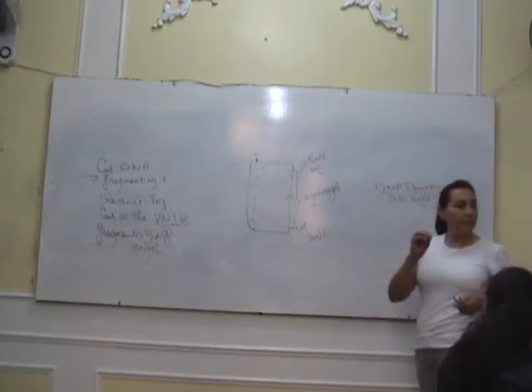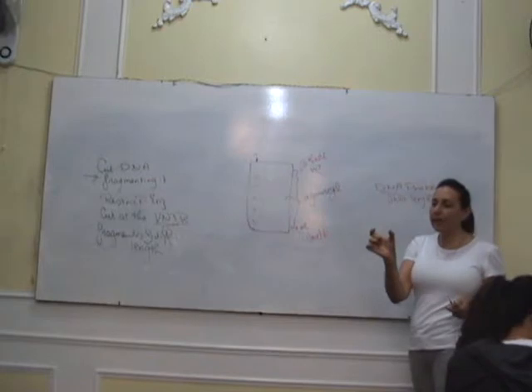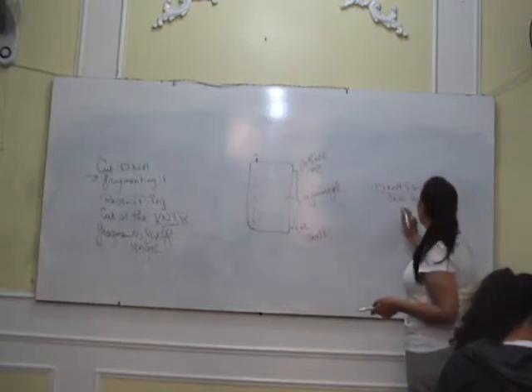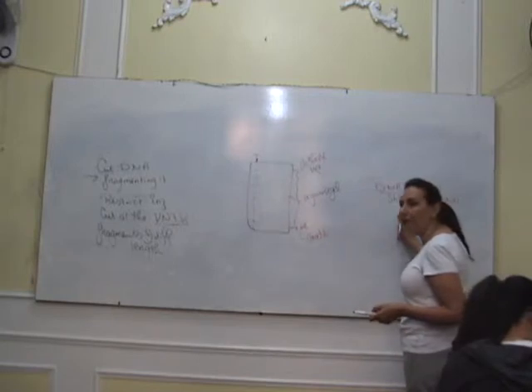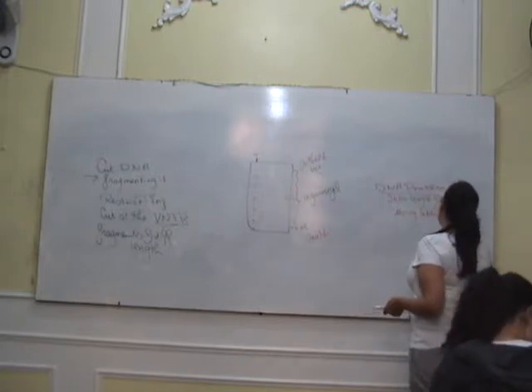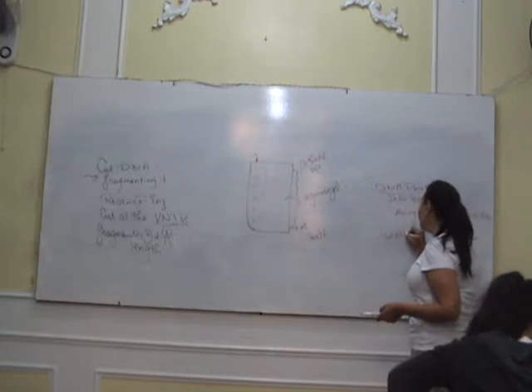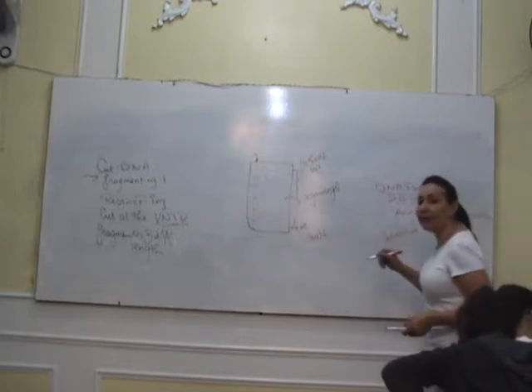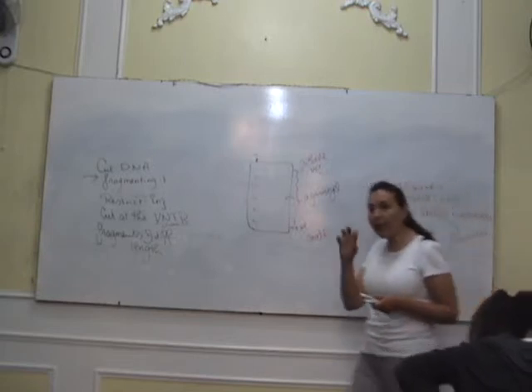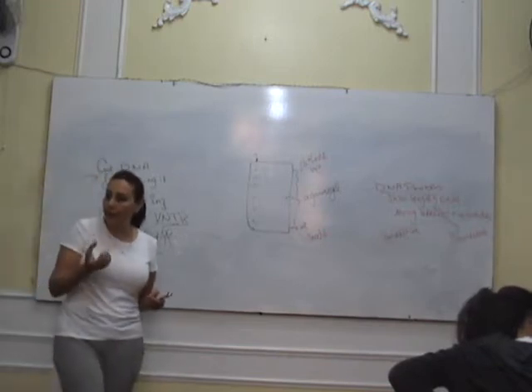As we said, the VNTRs are specific base repeats, the same bases repeated on and on. So we can make a short length of these bases, which will be complementary to the VNTRs. This short length of DNA is made using labeled nucleotides. The nucleotides are specially synthesized either with radioactive material, or with a material that will allow them to glow fluorescently in ultraviolet light.